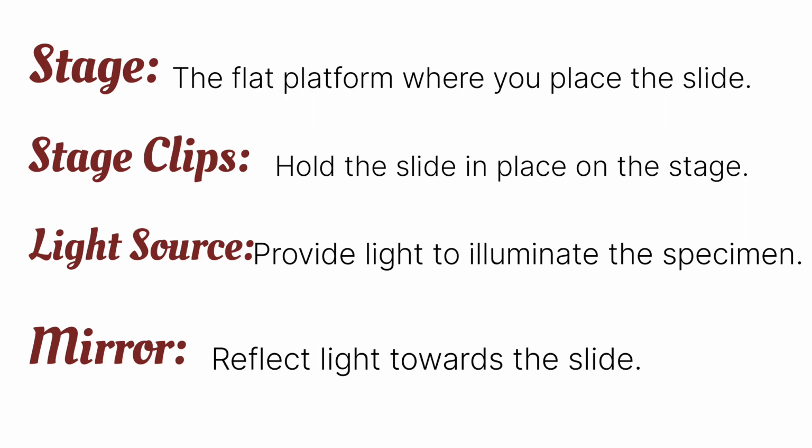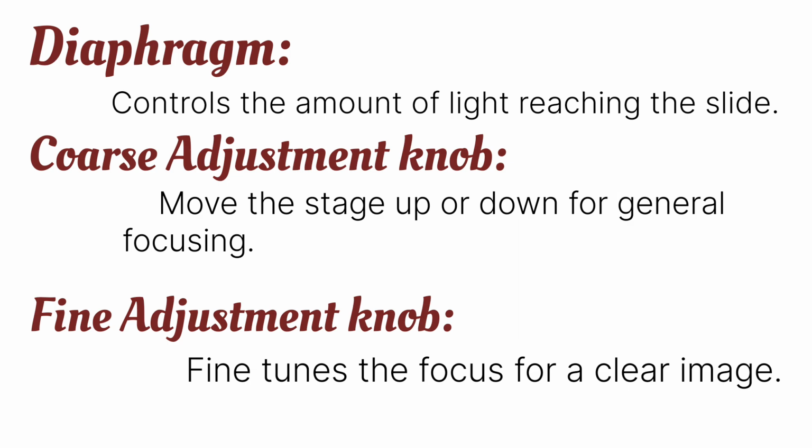Stage. The flat platform where you place the slide. Stage clips. Hold the slide in place on the stage. Light source. Provide light to illuminate the specimen. Mirror. Reflect light towards the slide. Diaphragm. Controls the amount of light reaching the slide.